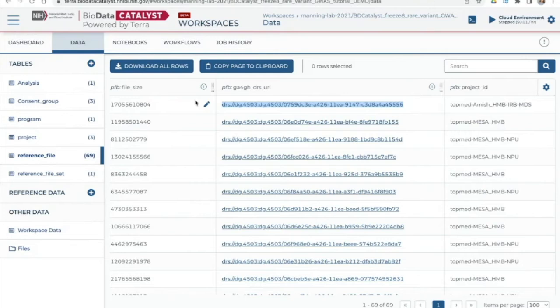So all of this, like you said, these are like VCF files that you've been able to sort of identify through Gen3. Later on, will we sort of circle back to what you did in PIC-SURE, where you got the phenotypic data? Like, will it all sort of come together? So we need both pieces.